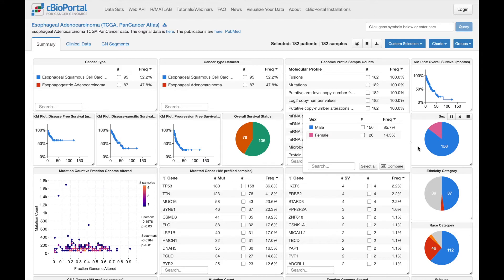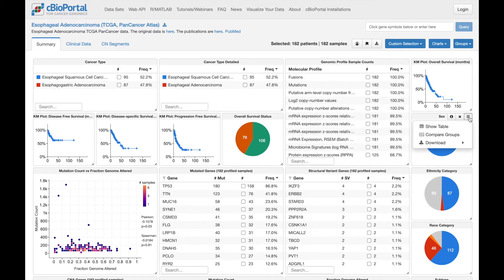Notice that when I hover my mouse over the pie chart, a tooltip appears showing the same data in tabular form. Also, note that every chart has a menu in the top right corner with some additional options. As you can hopefully start to appreciate, it's easy to explore the available data for a cohort by browsing these charts.